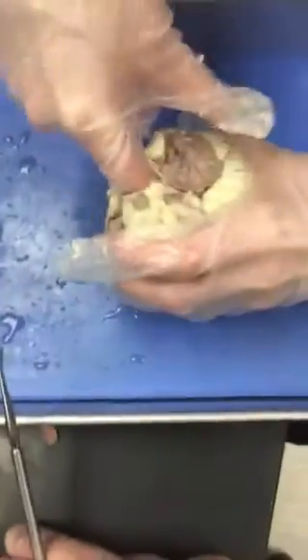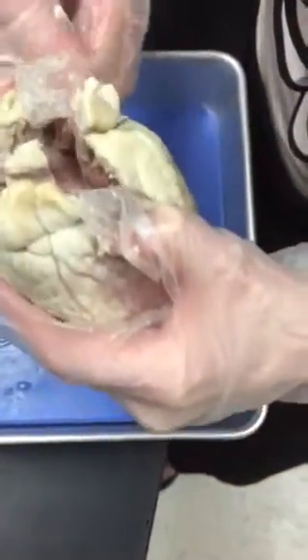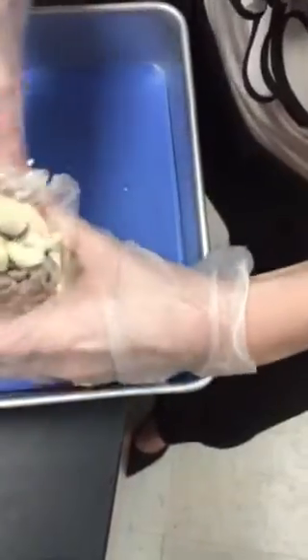It should lead directly to the left ventricle. Cut open the aorta and observe the thickness of the tissue. This may also get you a better view of the mitral valve.